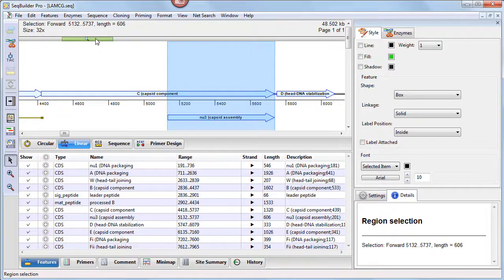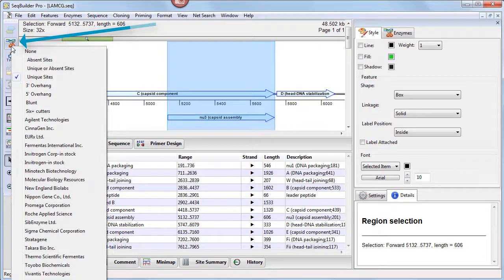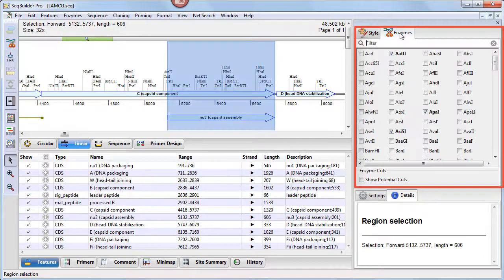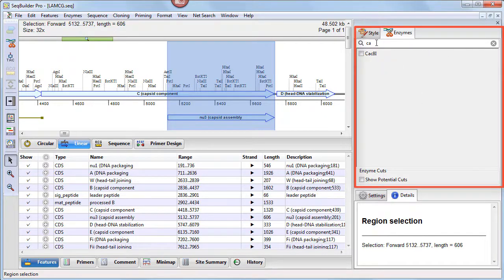In these views, you can now easily apply entire categories of restriction enzymes using the tools on the left. There's also a new enzymes panel that lets you choose from lists of enzymes in alphabetical order, and also lets you search for specific enzymes with our new responsive search feature.